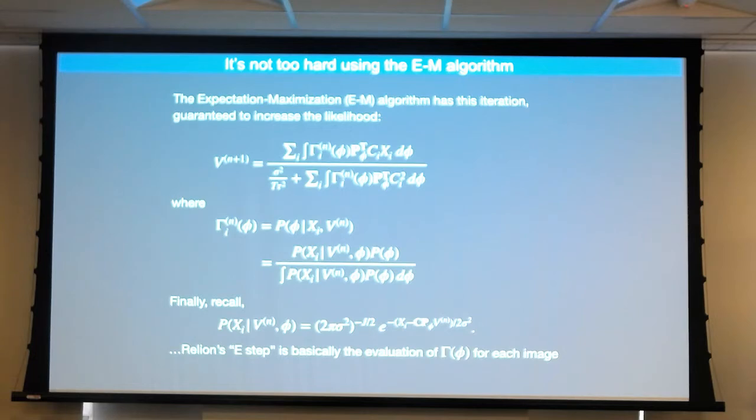Any other questions? So if you pick a high t value, you're sort of going out on a limb. You're sort of saying, I'm going to make this deconvolution a little bit sharper, but maybe amplifying noise.